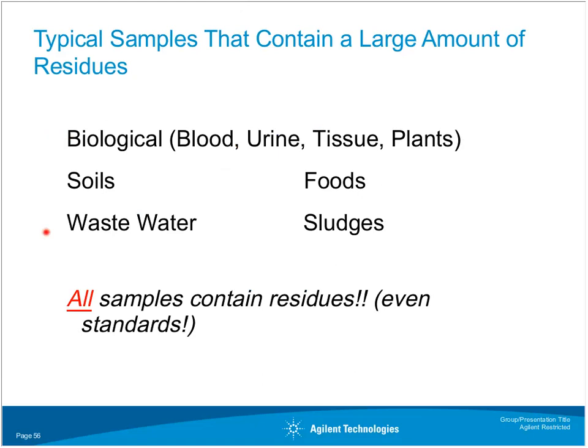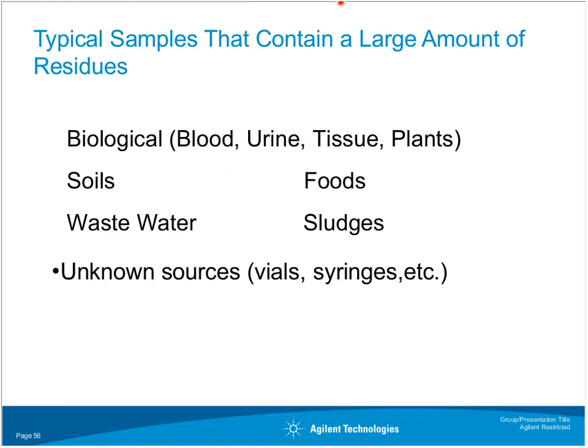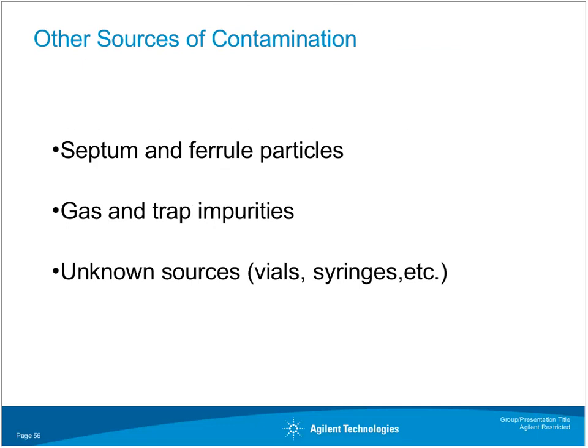But again, all these samples have a lot more residues than some of the others. These are where you want to be a little bit more proactive on changing liners, and doing inlet maintenance a little bit more frequently, as well as trimming the column.